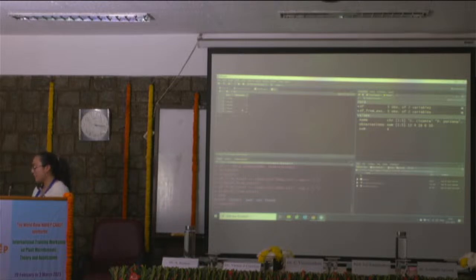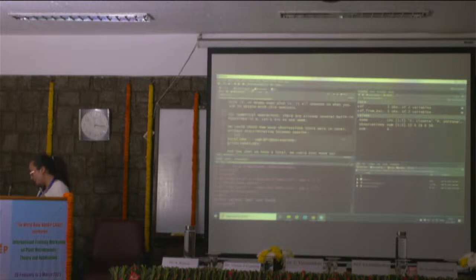So what we're going to do is just use this column that is called observations. The way we can do that is we write df, which is the data frame, and then with this $ sign, you can divide it into the columns, so you can select one column only.